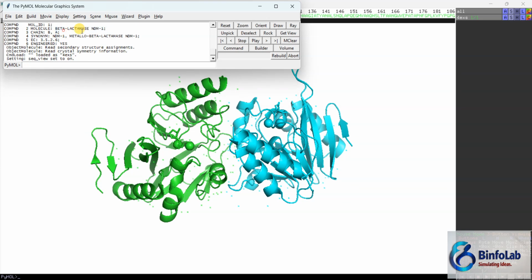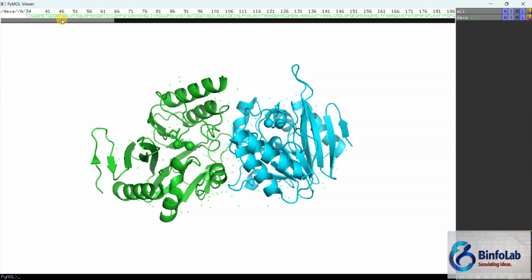The challenge that it offers, if you see, like this one is residue 42, GDQRF. If you see here in this chain, GDQRF. So it means both structures contain the same residue twice. If you want to probe residue 42 in one chain, it will not be as simple, because we have to use the chain identifier: residue 42 of chain A or chain B.